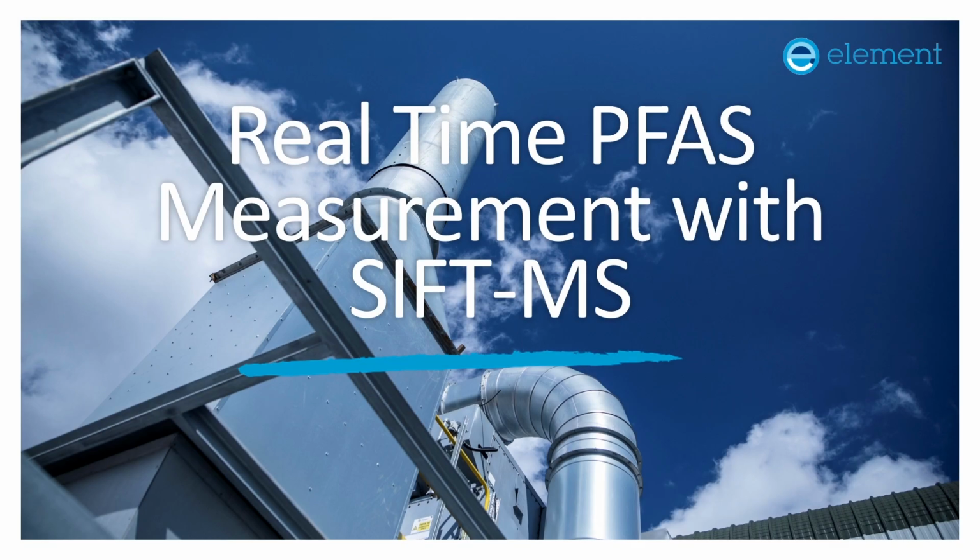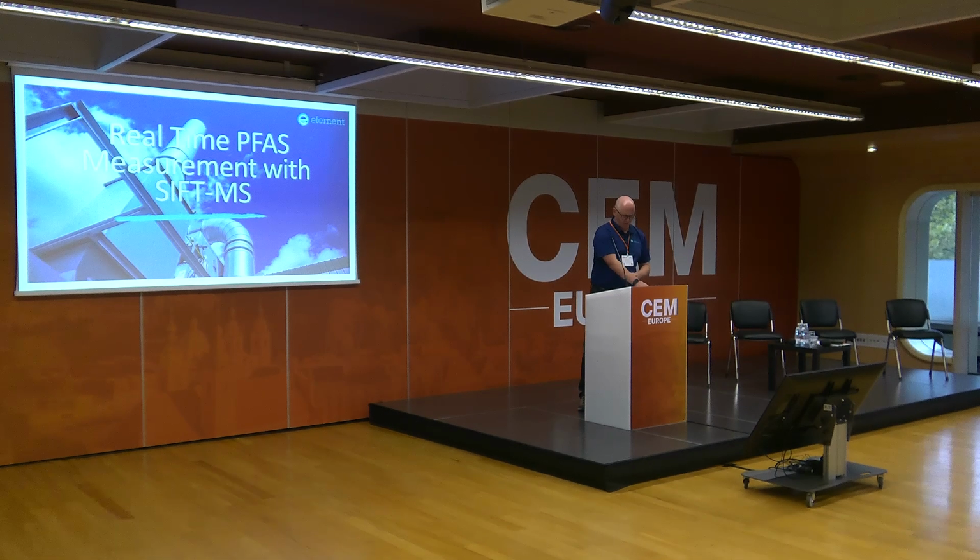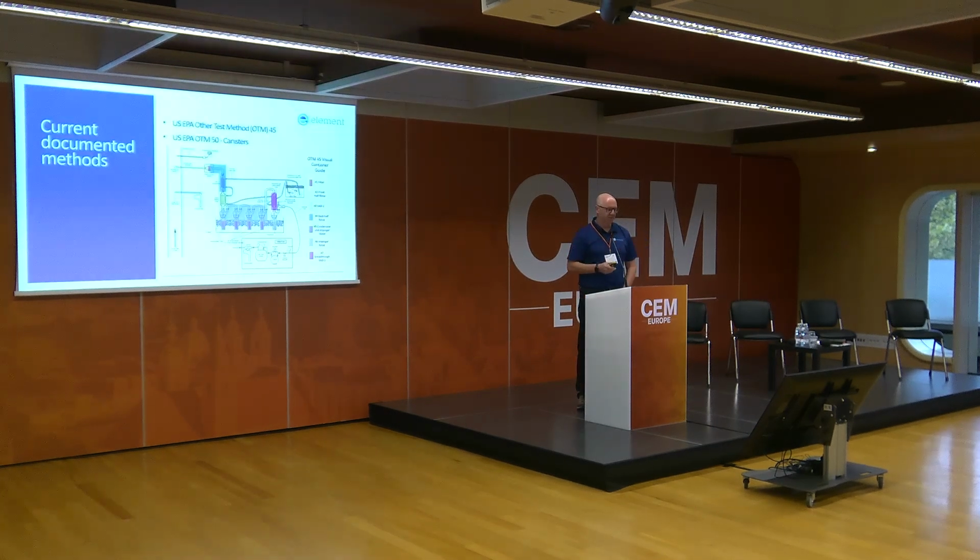I'm going to talk about today is really a project that we did about real-time PFAS measurements using the SIFT-MS. So this was a client request we got. Traditionally, Element are a stack testing company, test house, things like this. So generally we work to published methods.